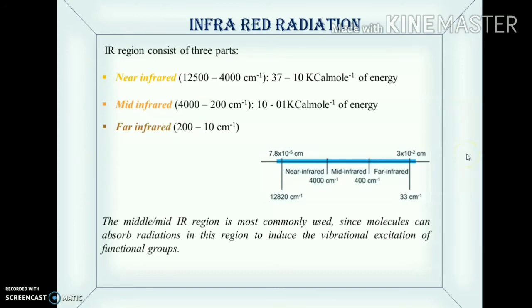But out of these three sections, it is the mid IR or middle IR region which is most commonly used by analytical scientists, organic scientists, and also in pharmaceuticals we take the help of this technique. This is because the molecules absorb the radiation in this portion to induce the vibrational excitation of their functional groups, which are present in the molecule.